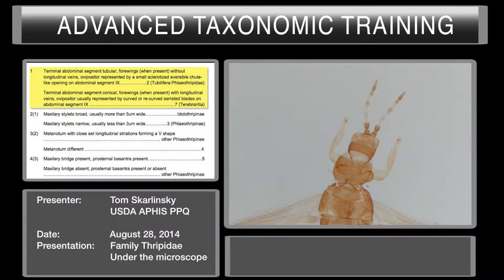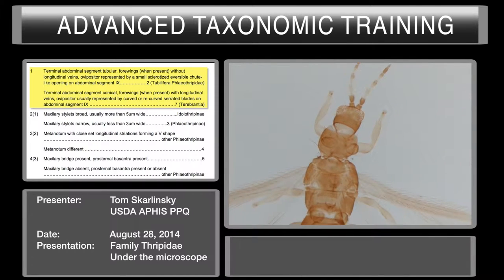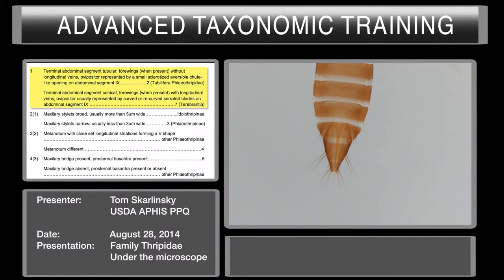We've managed to get it mounted on a slide and now we have to decide what suborder it is — is it Tubulifera or is it Terebrantia? The best place to look is on the end. What are we going to look for? Is the posterior or terminal abdominal segment conical, or is it tubular?